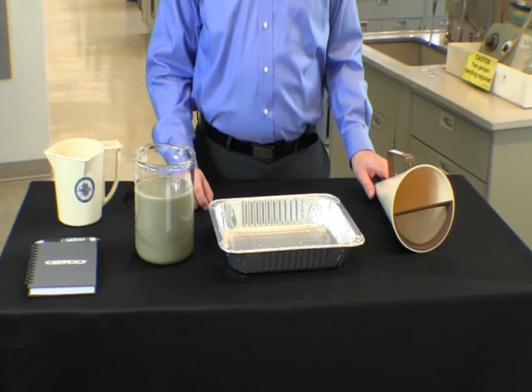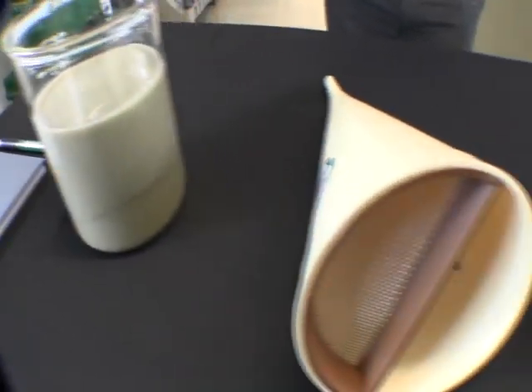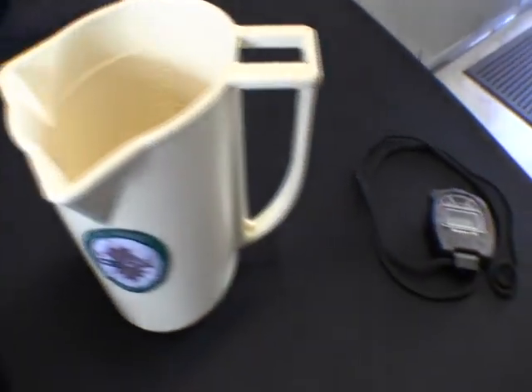For this test we will be using the following items: a notebook to record the results, Setco drilling fluid, marsh funnel, provided cup with one quart marking, and a stopwatch.